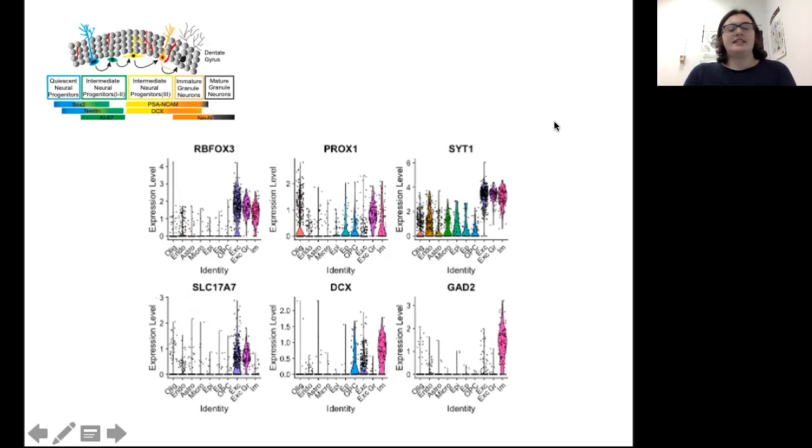So here we successfully applied single-cell RNA-seq to postmortem human hippocampal tissue. And once we're able to collect some more data, hopefully we'll be able to see some new markers of these cells based on the known markers and identify more specific cell identities from these clusters.